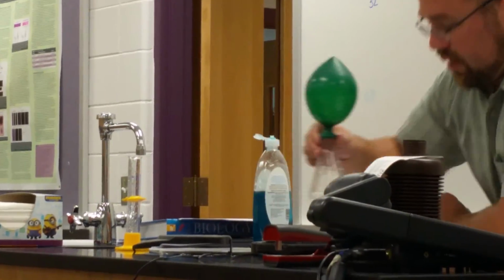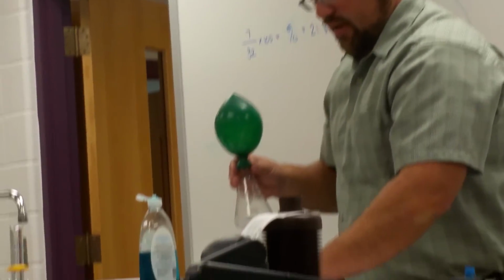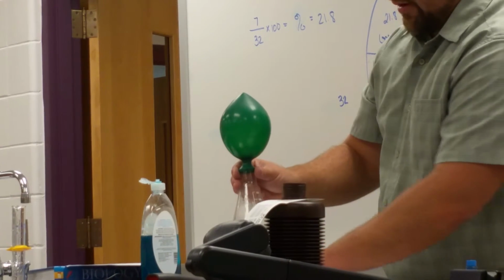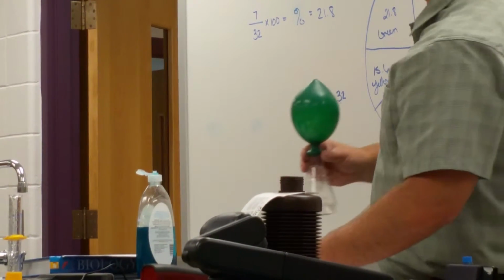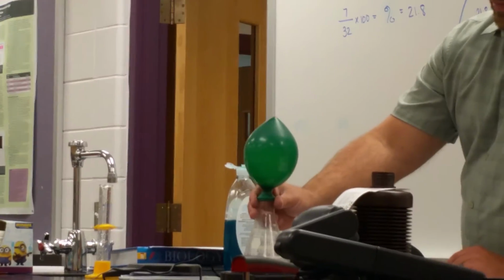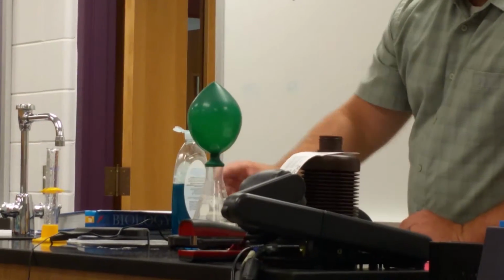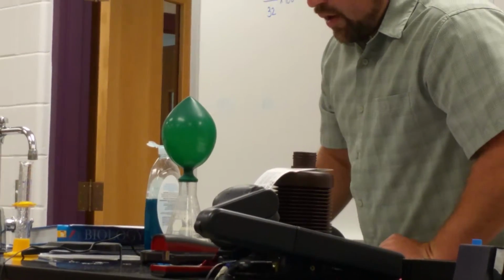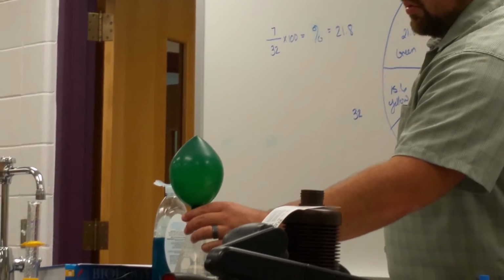So now, we go ahead and weigh this. Tare it off is what I want to do. And let's hope we end up with something close to 177.66. If not, there's an error in our experiment. What we ended up with was 177.59. Good news.